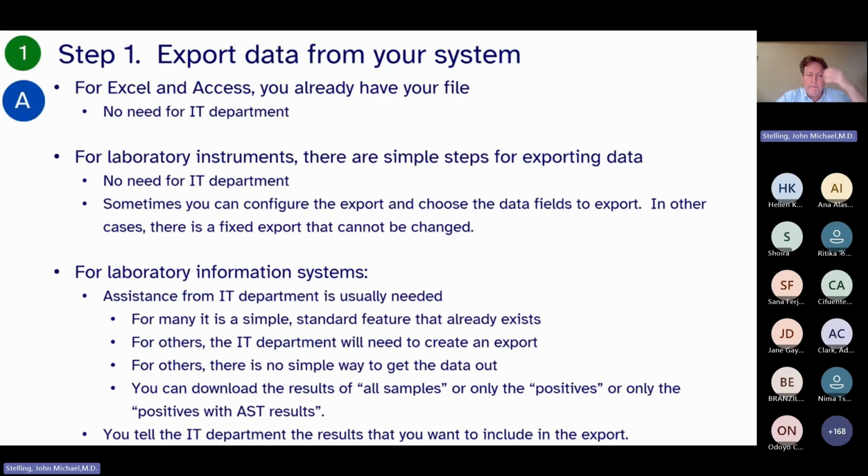So for many IT systems, it's easy to get the data out. For others, they do need to make an export. They say, well, we have the data. We can do this for you. I didn't even think of this for the slide. They say we can give you 2 options. We can put an export option for you on the screen so that you can do it, or we can do it for you on the back end. And their advantage is either way it can work.